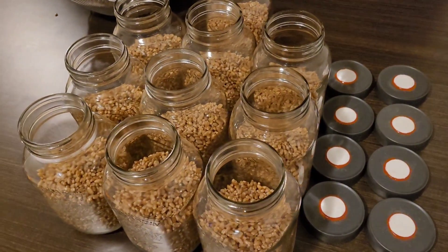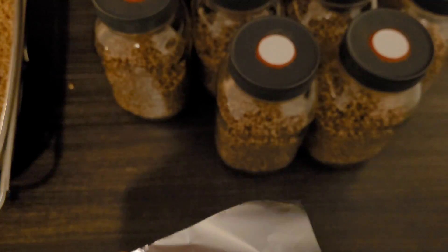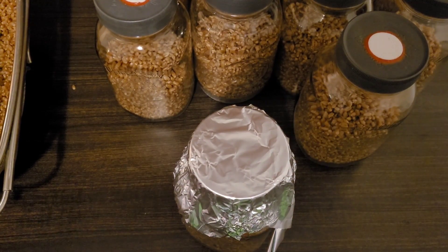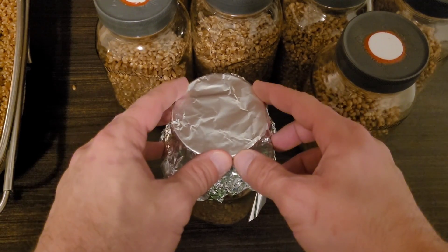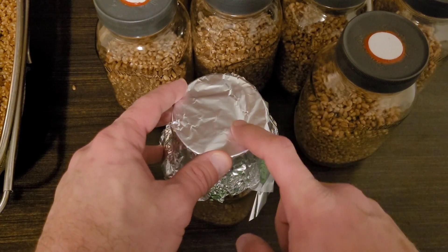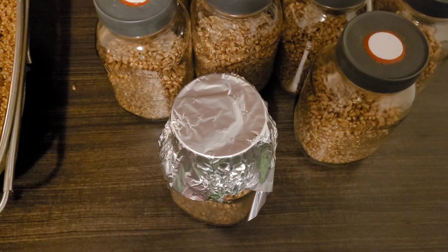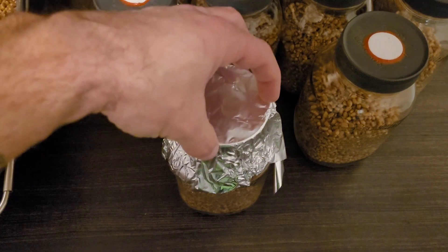Once you have your 10 jars filled, put your lids on. Once your lids are on you're going to need to make foil caps for them — just rip off a strip. People will say that these aren't necessary, and technically that's true — they're not absolutely necessary, but they're nice for maintaining the sterility of your lids post cycle. When you open up the pressure cooker or autoclave lid, you're going to have these jars exposed to the environment.